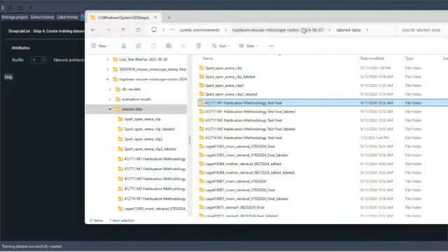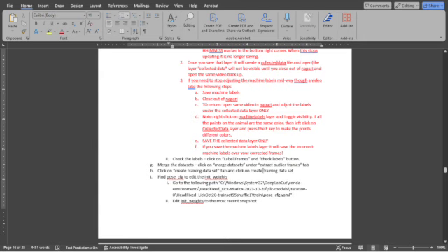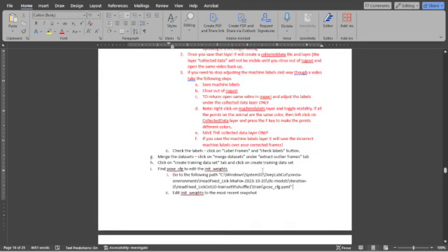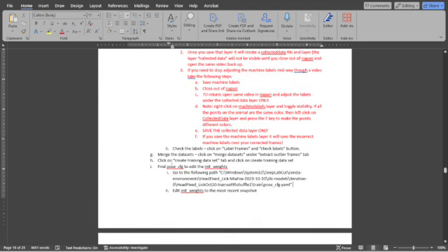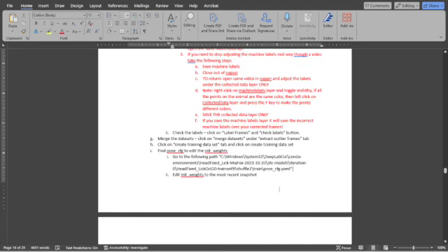And now what we need to do, and this is in the protocol, is define pose CFG and edit the init weights in pose CFG. So pose CFG is going to be in your model, so you can follow the current directory that's in step 1 of opening DeepLabCut, and then you're going to go into DLC models, and then your most recent iteration, and then train.